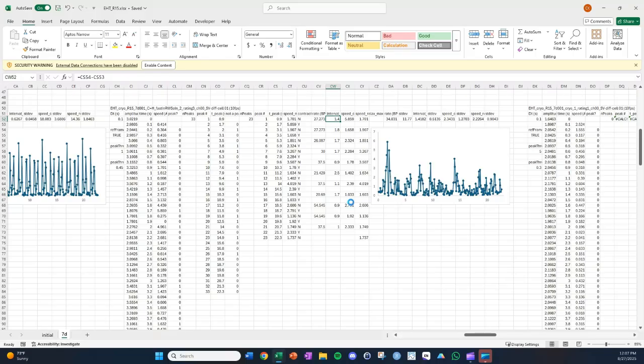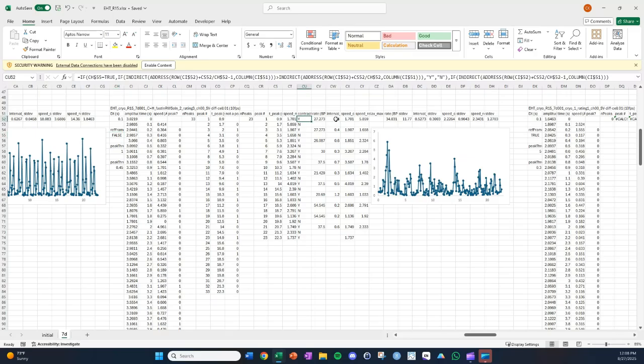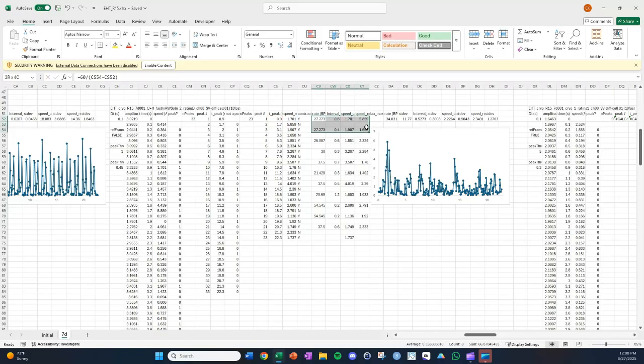And if we do it that way, then we get an unreasonable value for the interval. So I actually don't want to do that, so I'll click Control Z here to get back to how it was before, which means that the more reasonable value came when the reference frame setting here is false. So if I change that to false, this flips, and then these formulas, specifically this interval formula, is giving a reasonable value, I think, according to what it was before treatment. But again, you can always double check that, see if that matches with what you see qualitatively.